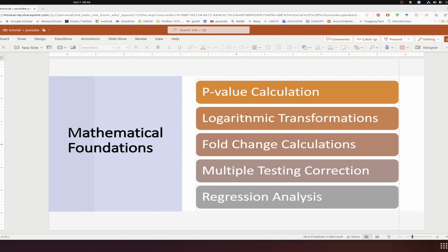So the p-value works for your null hypothesis and alternative hypothesis. If you really want to look, you can see some papers by Dudoit in 2002, where they were using cDNA microarray experiments to replicate the results. The second part is the log transformation of the result.